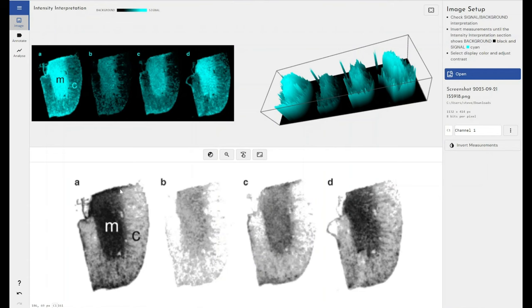And as an extension of that: which of my samples have I seen greater binding in? Do I have a greater receptor number for my particular ligand? And if I add an antagonist to my sample, what kind of intensity of antagonism can I get for the receptor for my radio ligand? All these questions we can answer by performing image analysis within the Phoretics Toolbox.